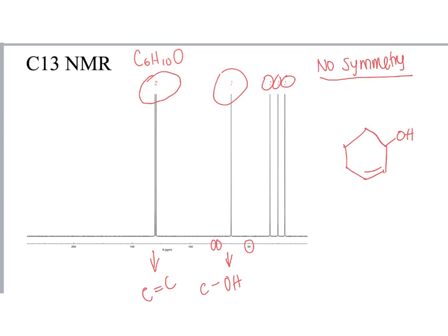We can see how these carbon environments are these two peaks right here. The other two carbon environments that we see are this one and this one. And then the last two other carbon environments are these two right here.